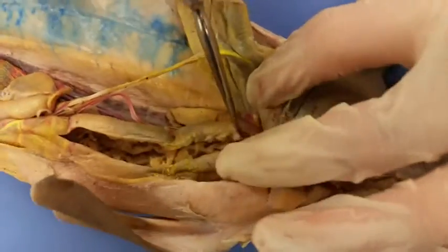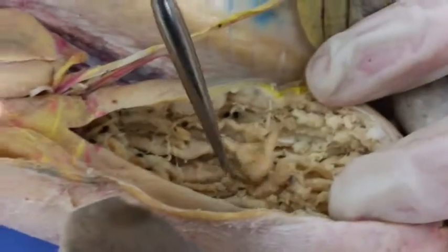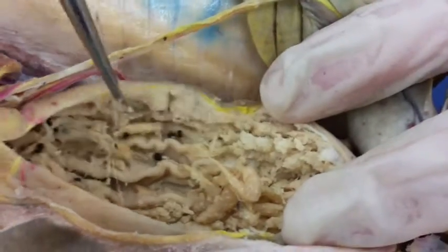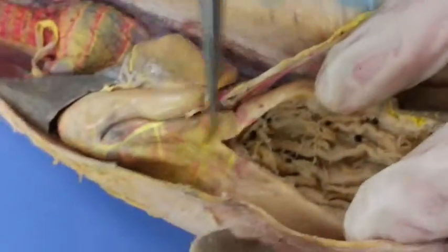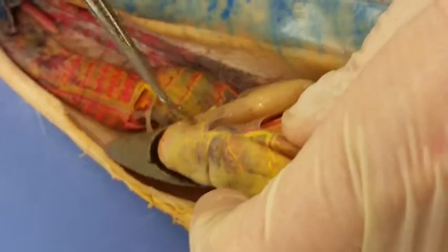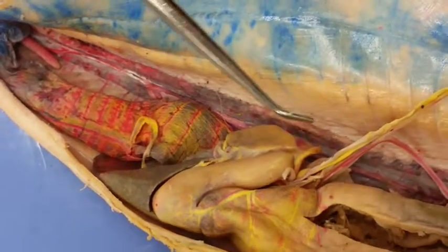Okay, so we have the esophagus leading down into the stomach, which we have cut open. You can see many small shrimp that our shark had feasted upon shortly before it was killed, so that we could learn from it. Thank you, shark, for your sacrifice. Stomach continuing down and down and down into the duodenum, past the pyloric sphincters. All pretty easy to take a look at.